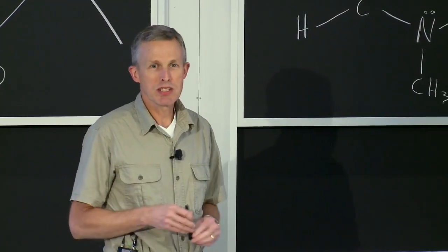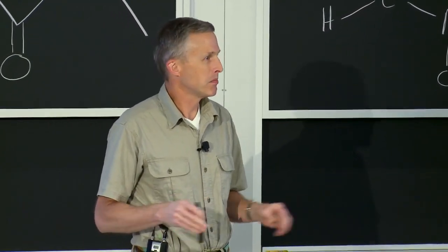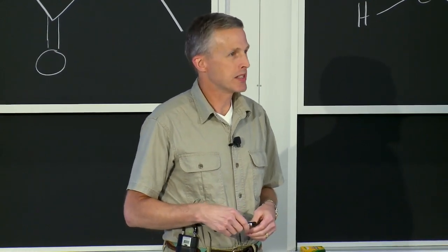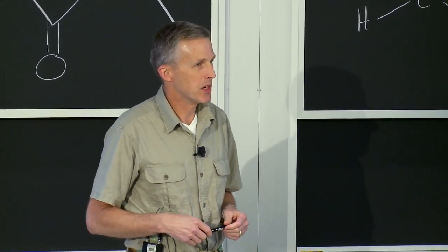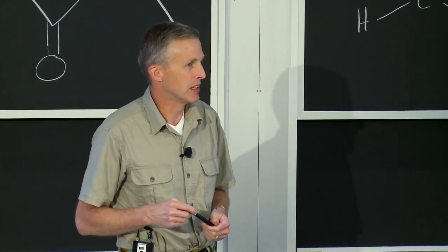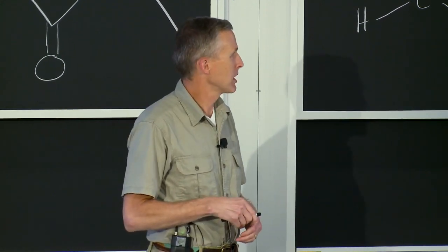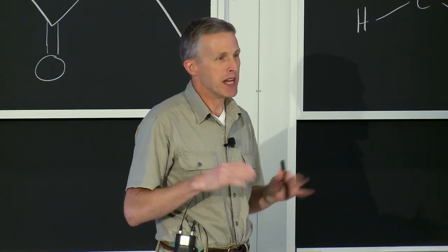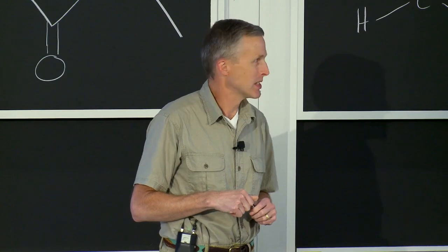So each of these has the exact same constituent parts. I didn't go over and try and take your benchtop instrument apart to get a picture of those parts because I wouldn't have gotten it back together and it would have never worked. So I'm going to go through one of our instruments and show you the individual parts. But keep in mind, it's the exact same thing that's in the instrument that you'll be using.